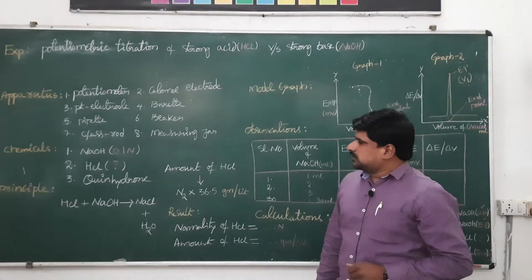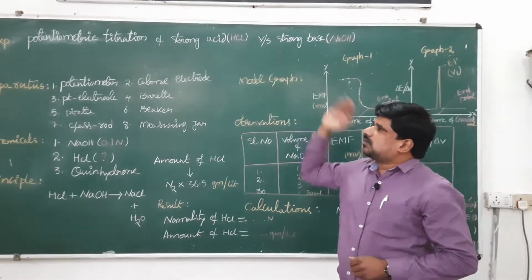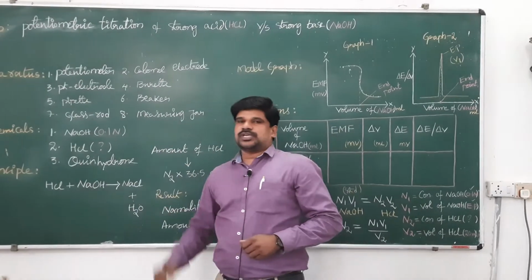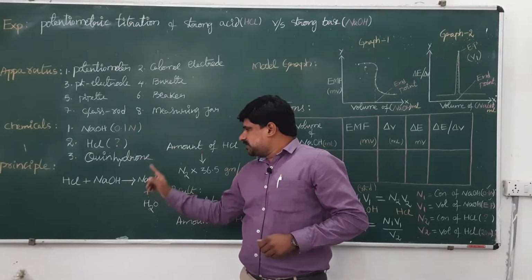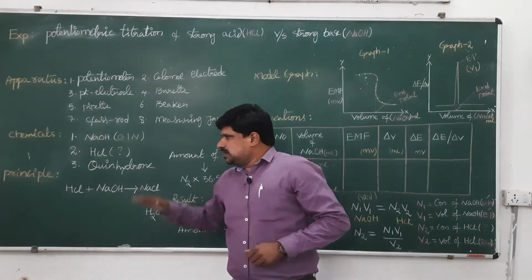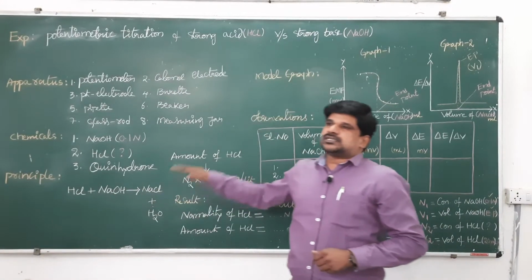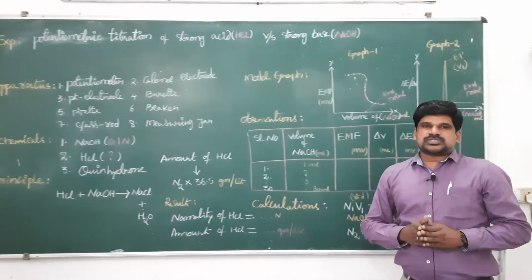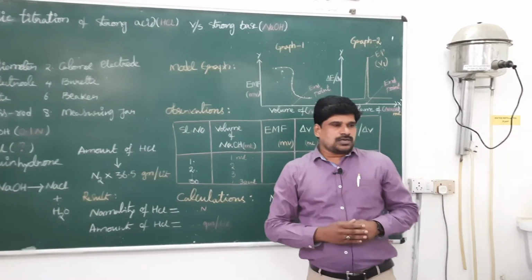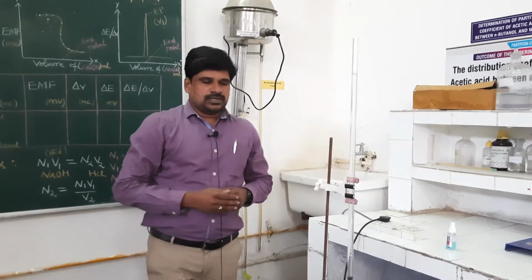Next, the principle involved in our experiment is that HCl reacts with sodium hydroxide to form NaCl plus water. So this is our principle. Next is the procedure, that is, how the experiment will be carried out. So let us start our demonstration here.